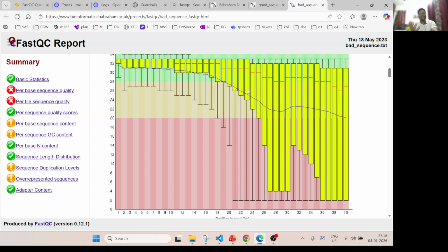These models are text models, so you can pass the text output, and we can provide some tools to the agent which will help it understand what this means, and based on that the agent will be able to provide a decision, like whether it's good or bad quality.